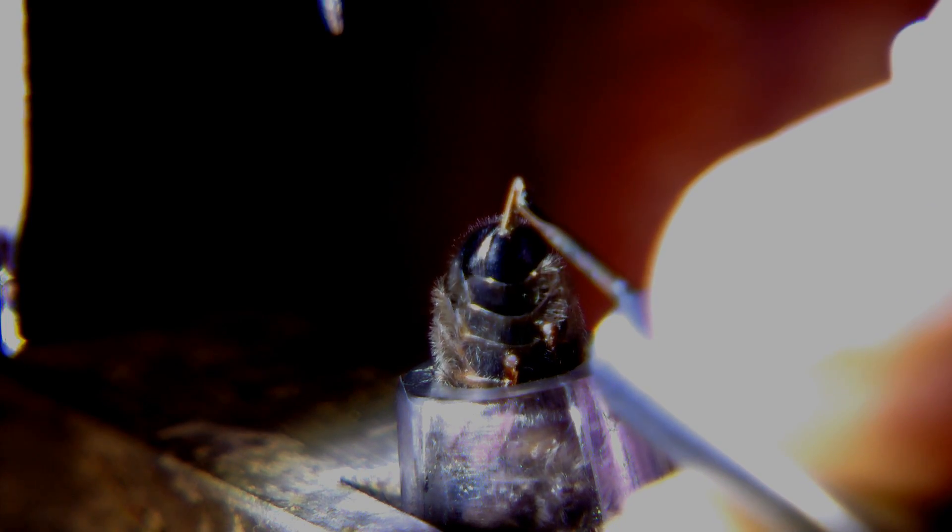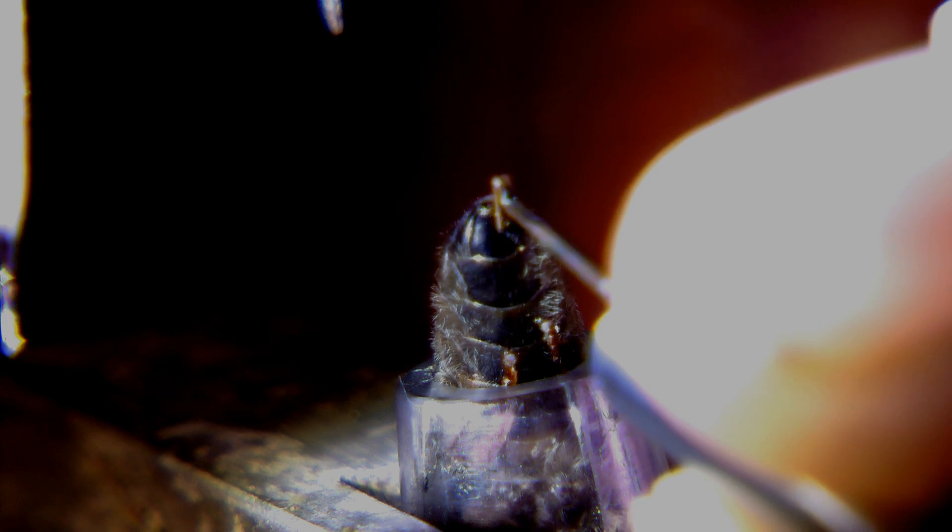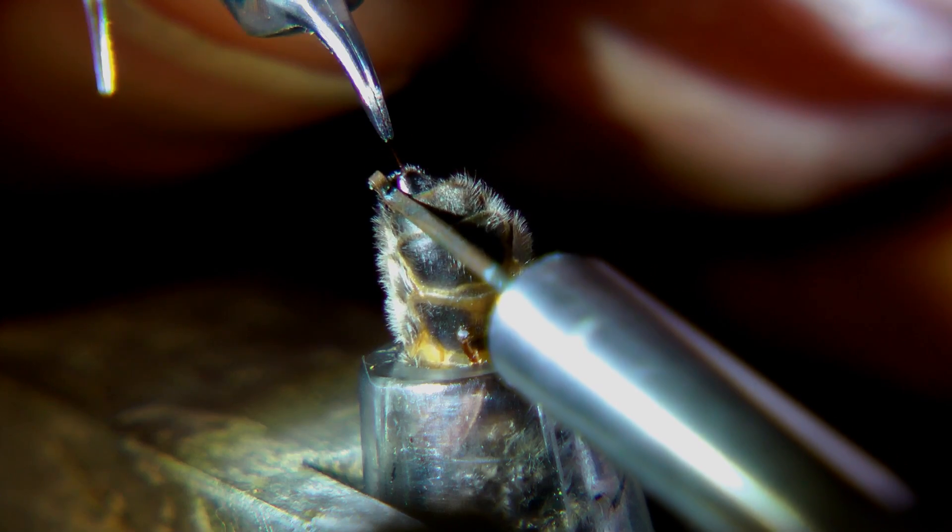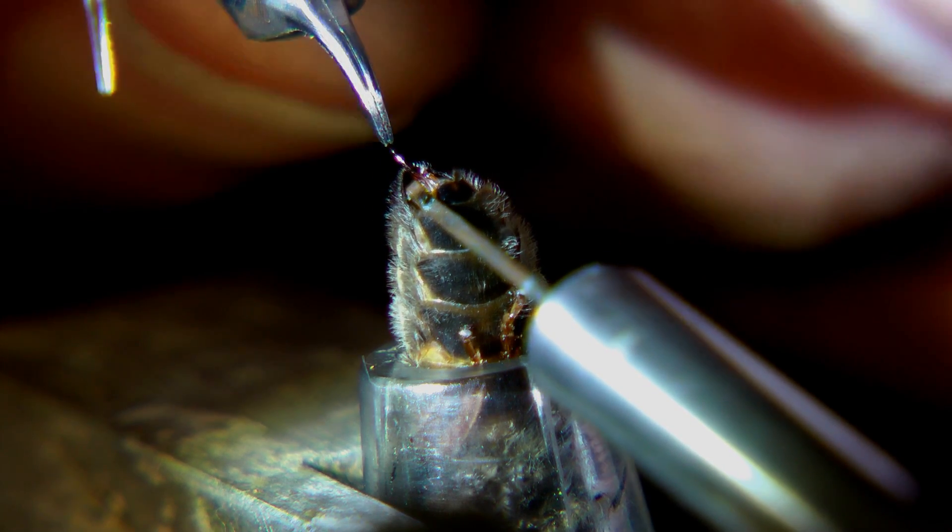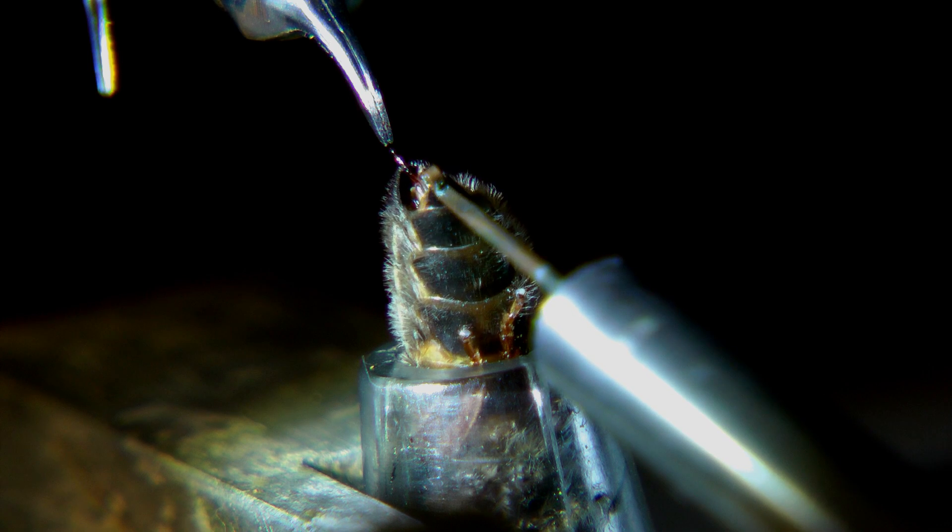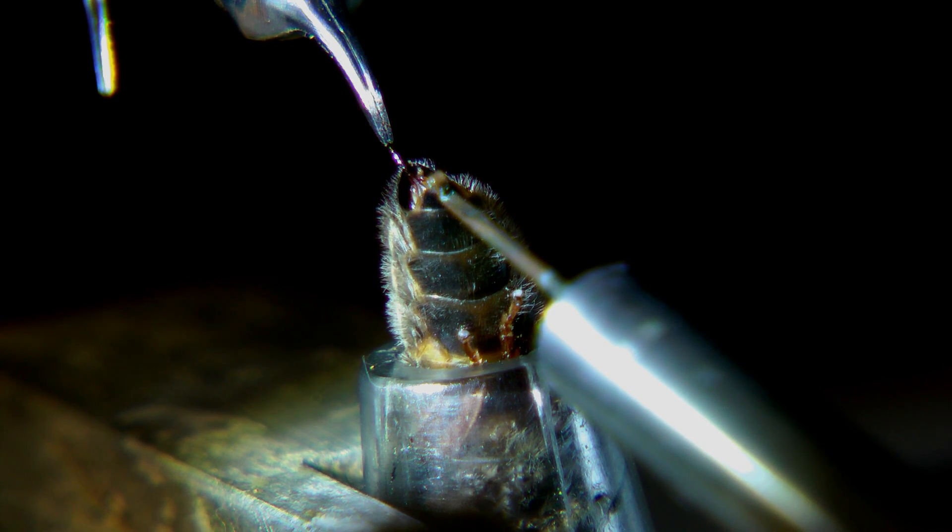Bill starts as soon as the queen is subdued enough to minimize the time the queen is subjected to the gas. Bill grasps the stinger with the forceps and together with the hook exposes her vaginal orifice.